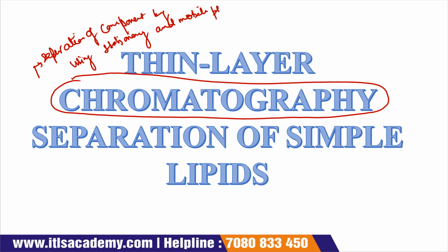So in chromatography, we separate the components by using the stationary phase and the mobile phase.